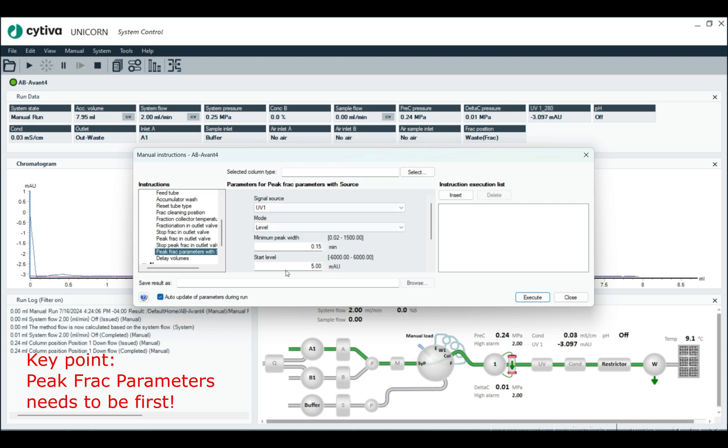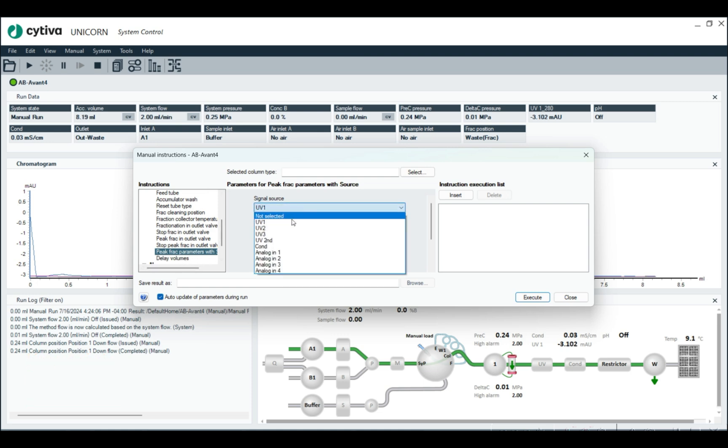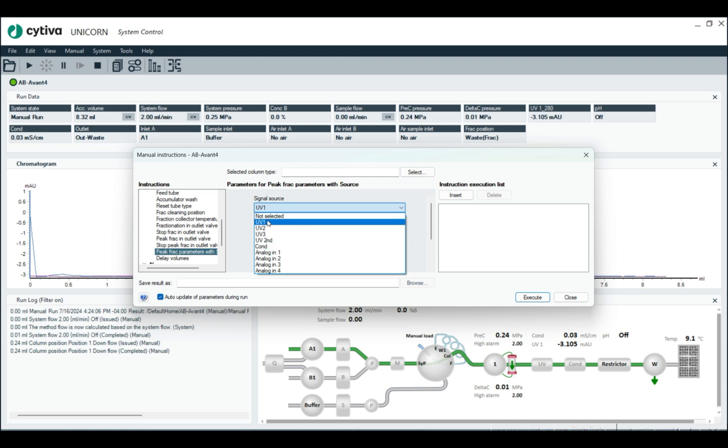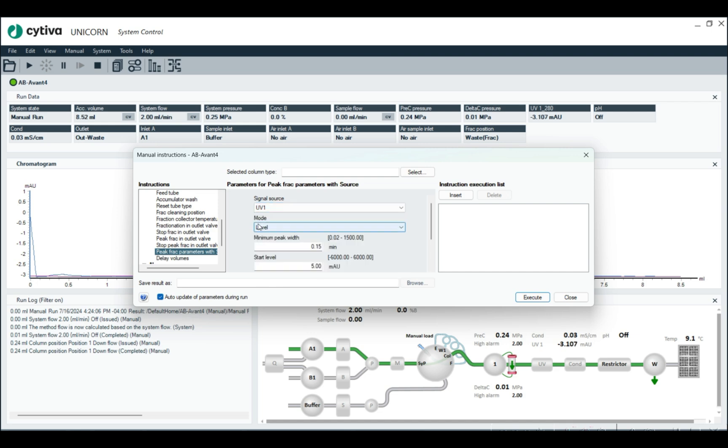So peak frac parameters tells you what to look for, and then peak fractionation actually tells you what volume to collect. So let's just go through line by line here, what we can do with peak fractionation. So first is the signal source. This is pretty self-explanatory. Really, you can collect UV or conductivity or any analog out. We're just going to do UV.